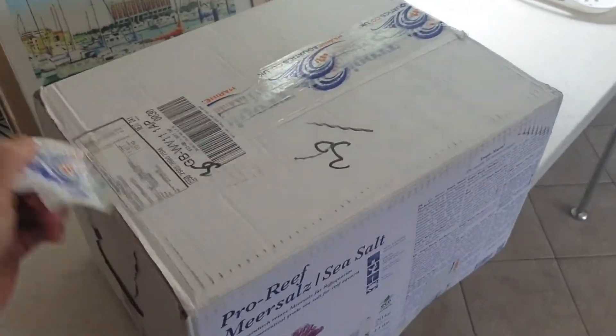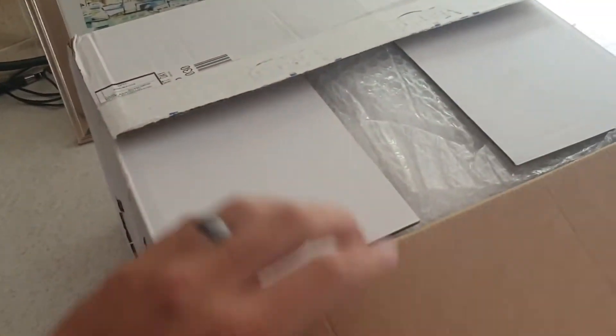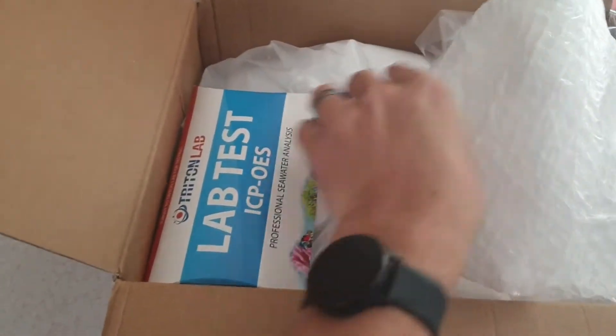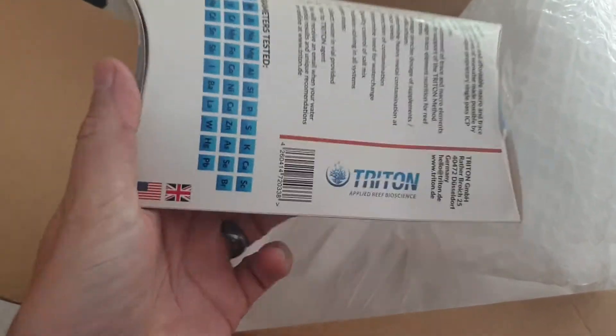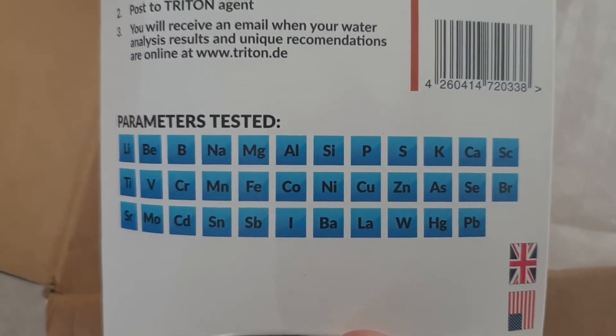A quick unbox — let's get this undone. Obviously this is the salt that's come in. And there's the ICP test — Triton Lab. Turned it over, and on the back you've got all the parameters that it will be tested for.